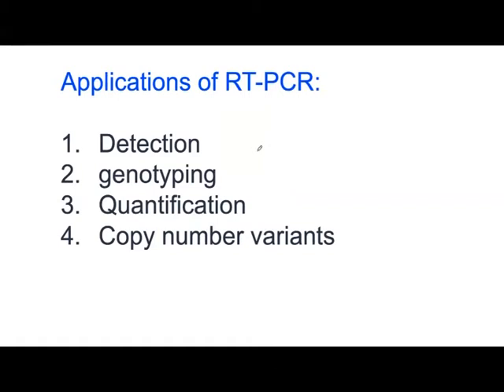We have a large number of attendees for whom this is the first time they hear about RT-PCR. That's why in the first part I spent time describing what PCR and RT-PCR are, and the two methods, SYBR Green and fluorescence probes. I mentioned that because it will help participants know about different applications.